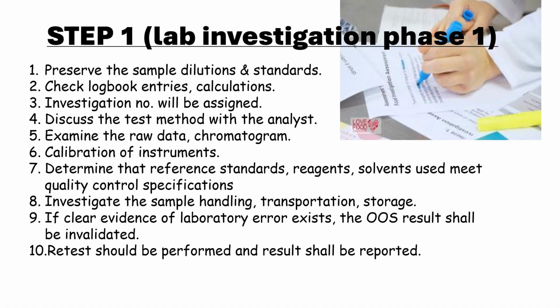And also the HOD, if there is no evidence that the sample was stored properly or the dilutions made by the analyst were not correct, the role of the HOD here is to investigate if the analyst went wrong somewhere. Not only the analyst, but was the instrument that was used during the analysis calibrated? Was the instrument giving the correct result? So this also should be investigated by the HOD.